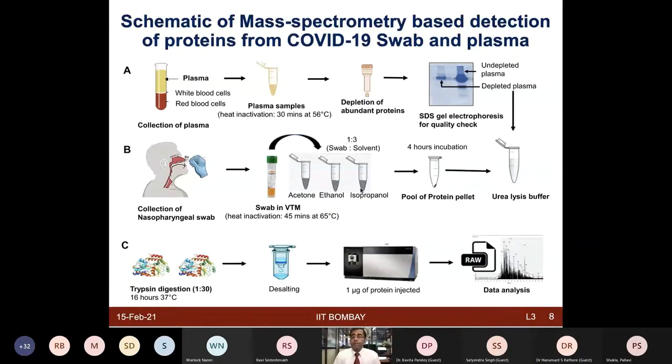So we just tried independently, and the thought was, even if a patient is in a remote area, somewhere in a rural area, and you want to collect the sample, one of the bottlenecks for real-time PCR work is that the sample has to be collected and stored at 4 degrees for the RNA-based work, in cooling conditions. We were thinking that if you are measuring peptides only, you don't have to amplify the peptide. So as long as we can get the protein precipitates, one could take that forward and do the digestion to get the peptides.